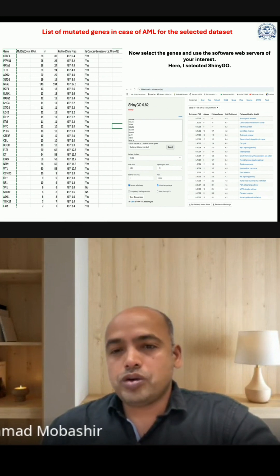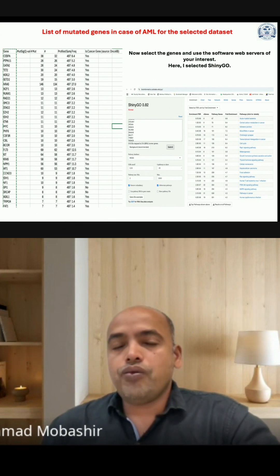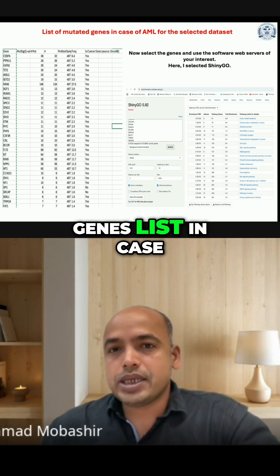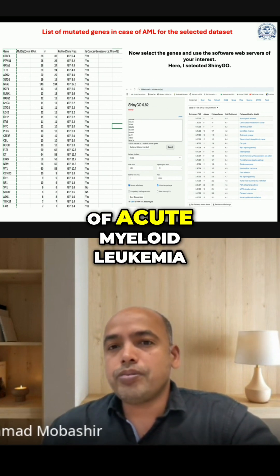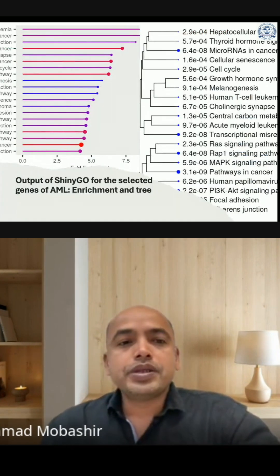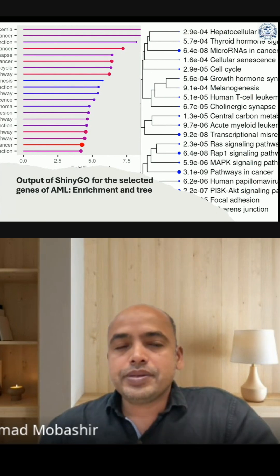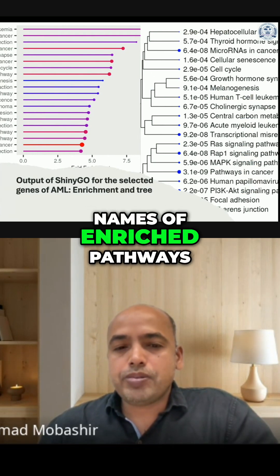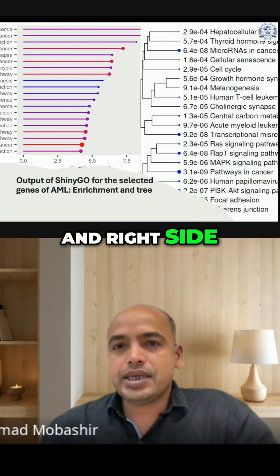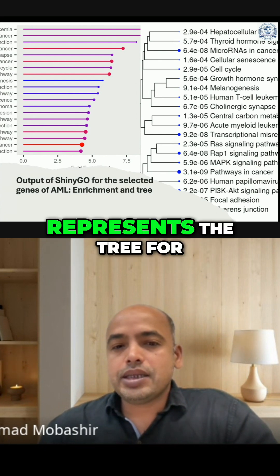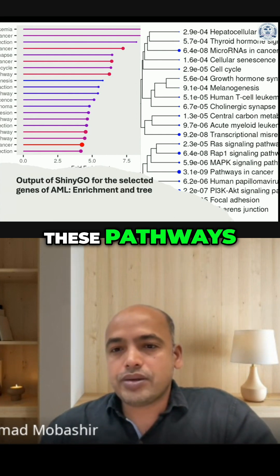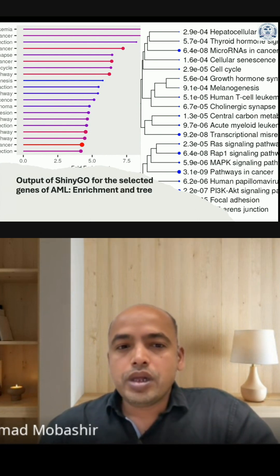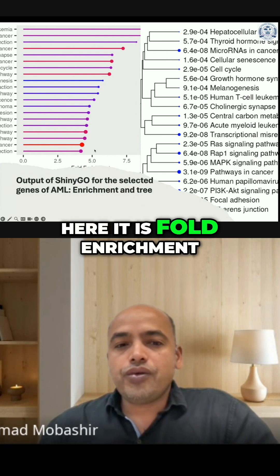All these things are the output for the selected mutated genes list in case of acute myeloid leukemia. For example, the left side shows the names of enriched pathways, and the right side represents the tree for these pathways with the p-values followed by fold enrichment.